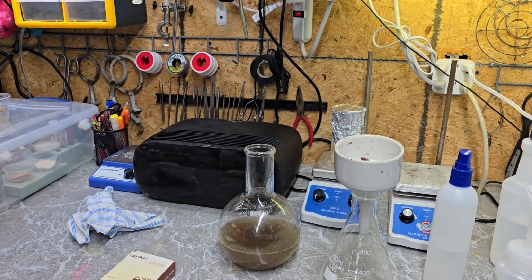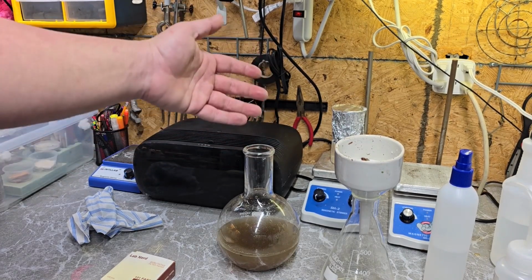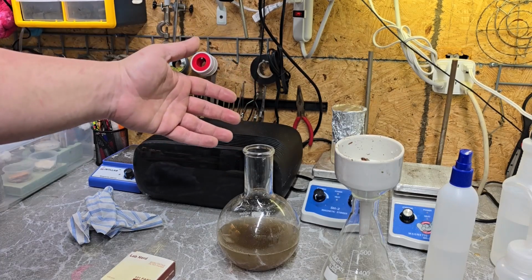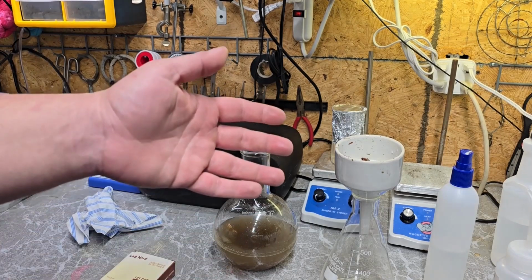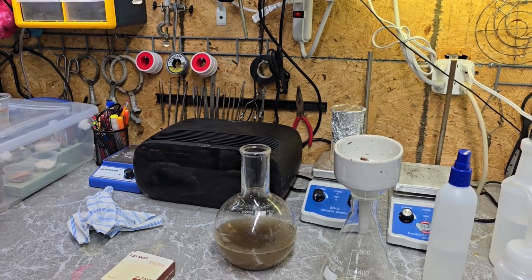So let's do that. Oh, and whenever I did this washing step, I did use distilled water. I don't think it really matters all that much, but I just didn't want to use tap water because of the chlorine. It might kill off whatever's in here. So just to be on the safe side, I used distilled water. Not a big deal, though. Okay.